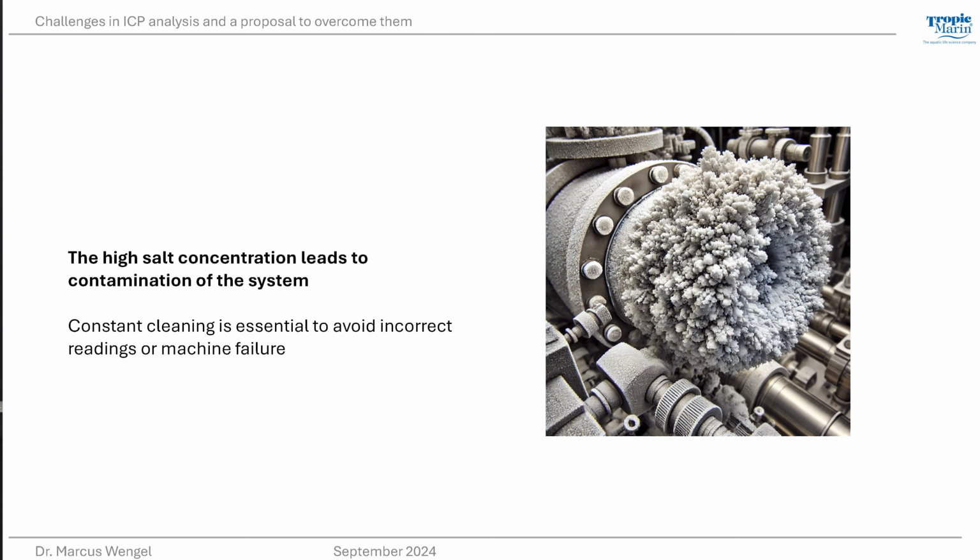One more thing, which is also important: we work with high salt concentrations, right? We have 3.5% salt in our tanks. So this can easily lead to salt contamination in the system, right? We dry this water out, so we get these plugs there.